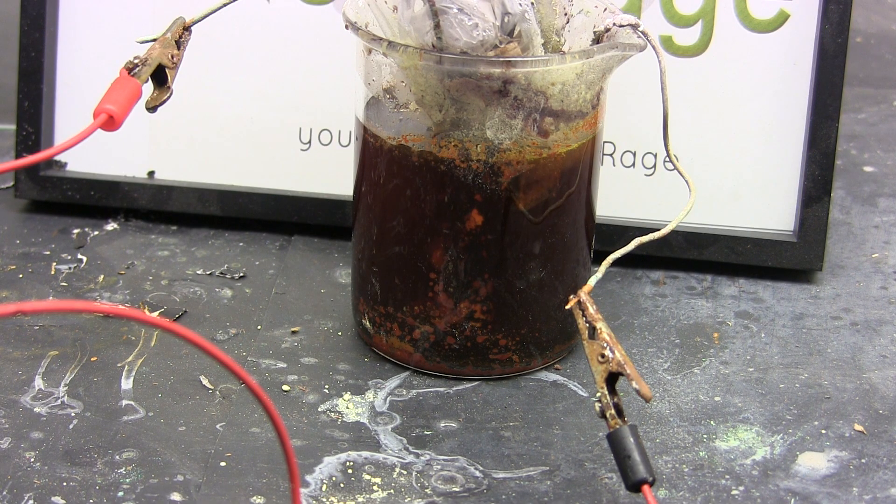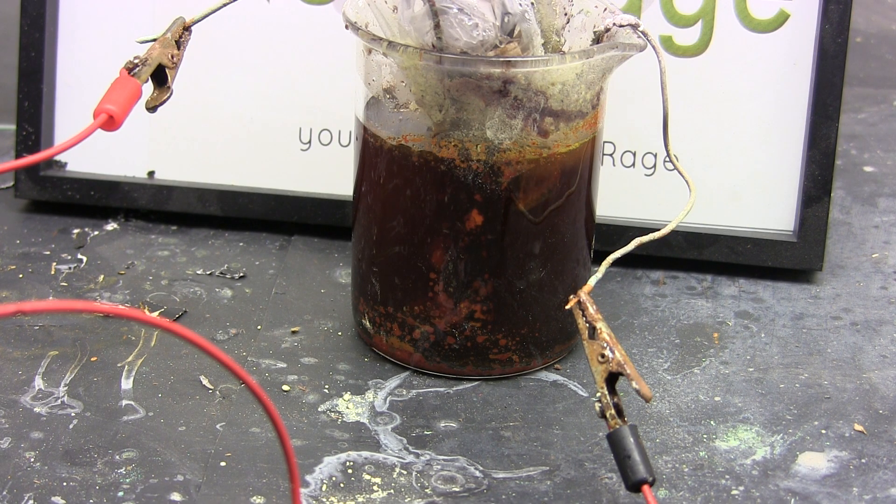Since I started with 16g of sulfur and used a current of about 2 amps, I ran the electrolysis for a total of 40 hours.